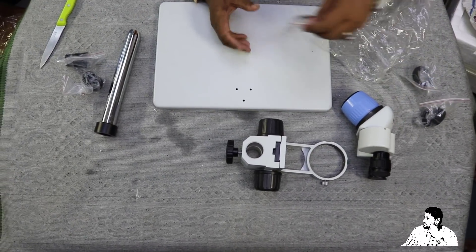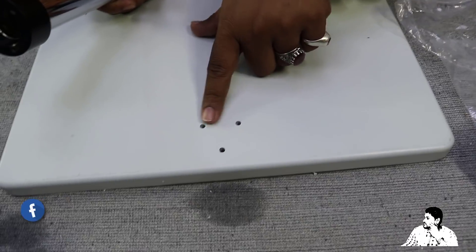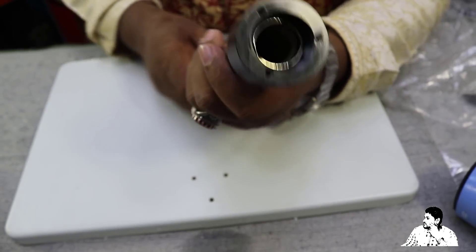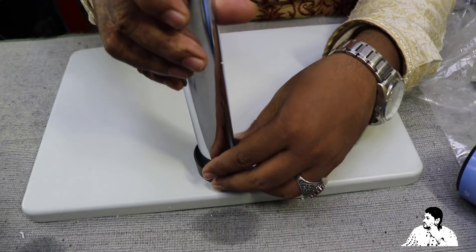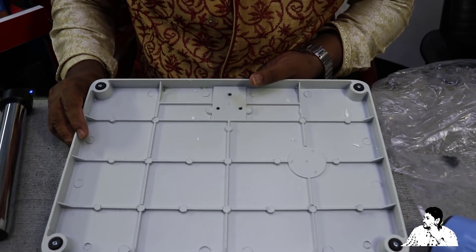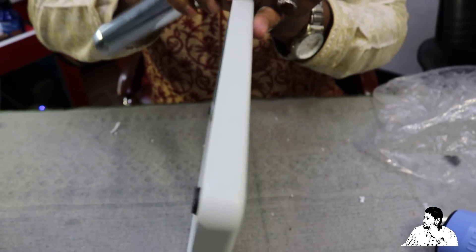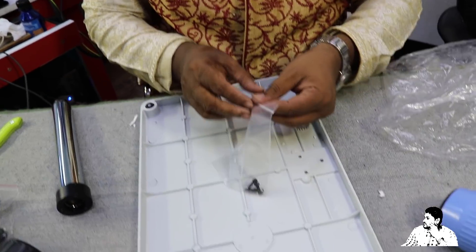I will set up the screw. I will set up the power open. I will set up the system setup. This is the screw, but the screw is on the same thing.